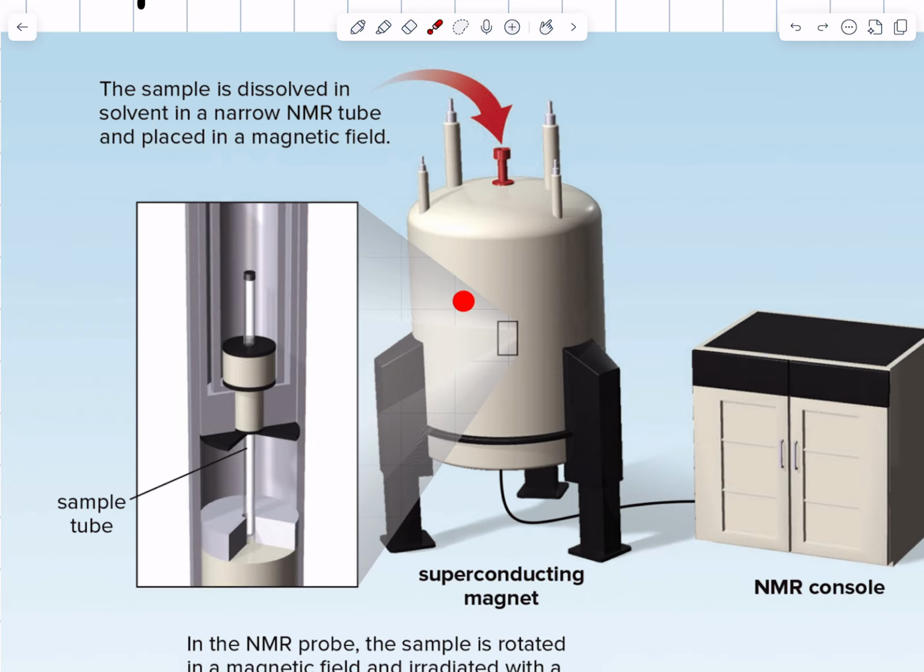And then you charge up the coils once, and because they're superconducting, there's zero resistance, and so the current circulates indefinitely. But you've got to keep it cold, and so people are always going downstairs dumping liquid nitrogen in. There are thermoses inside thermoses. There's a liquid helium thermos, and there's a liquid nitrogen thermos on the outside of that that keeps the liquid helium cold. And as long as it's cold, you've got a magnetic field.